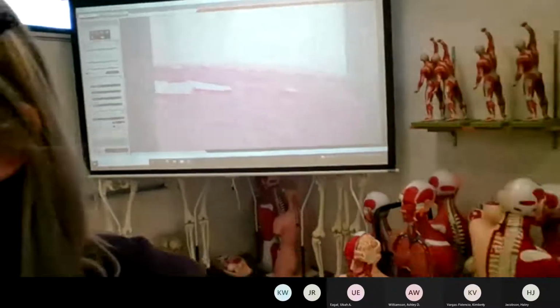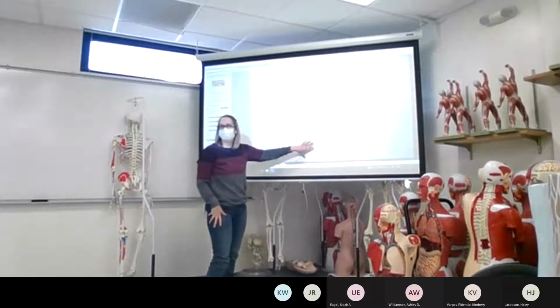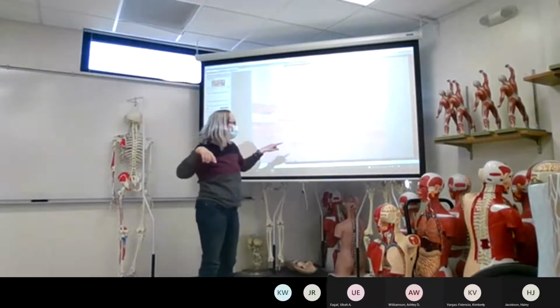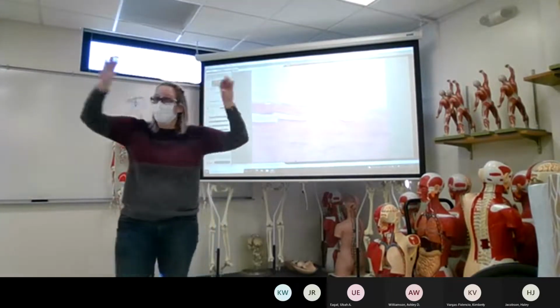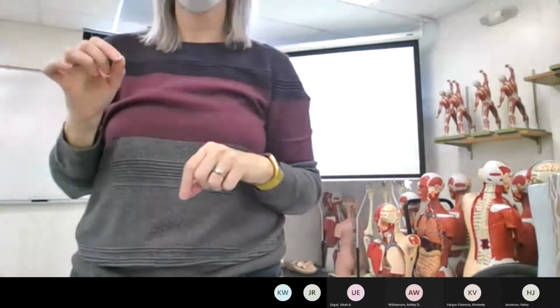You see a few cells, a little bit of the black. Again, we don't know for sure how much of it is stains on the glass or stains on the microscope, but there are some cells embedded in here, but there's not as many. It's mostly just protein material. Okay.